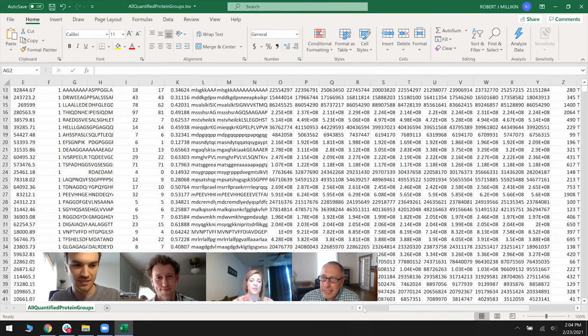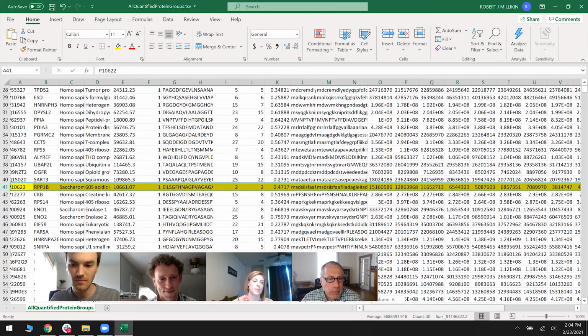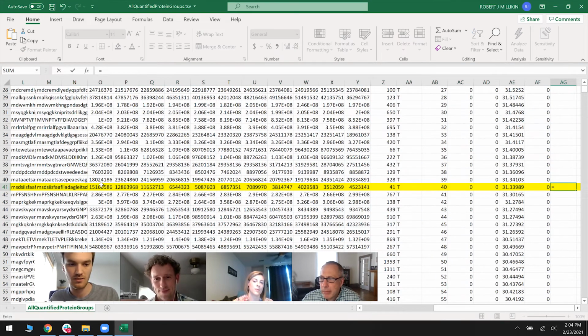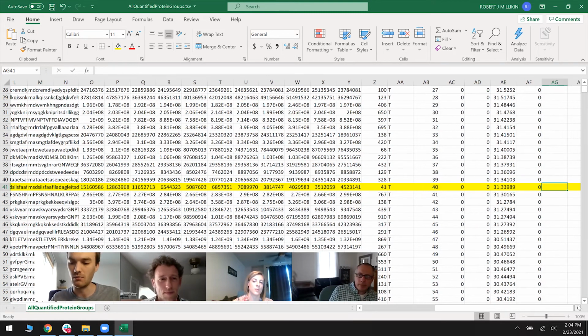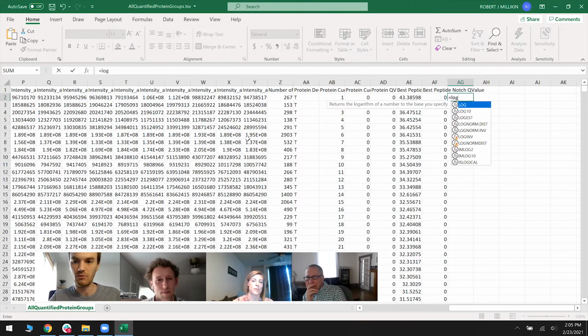You find a yeast protein. Just highlight this. And then like this, for example, divided by that, it's around 4. So again, around 3-fold with some noise. So that can result in some pretty large numbers or very small numbers. So typically these are log transformed just to make them a little bit easier to plot, really, is what it usually is.